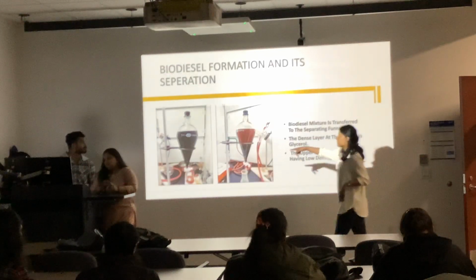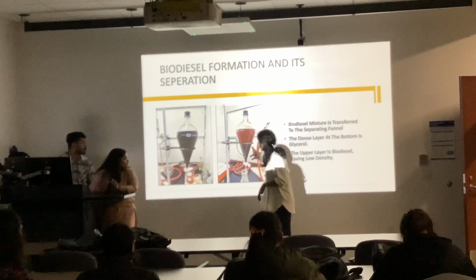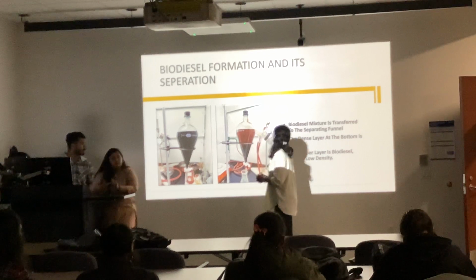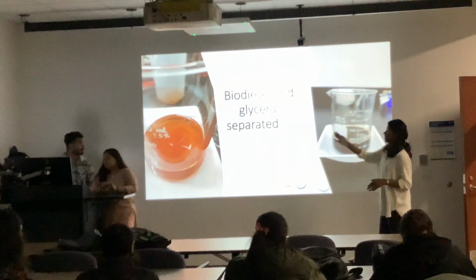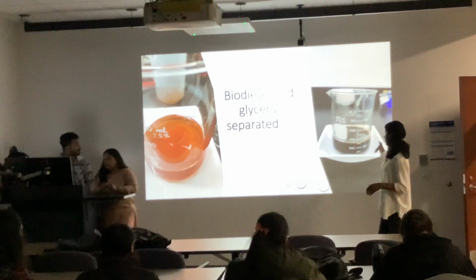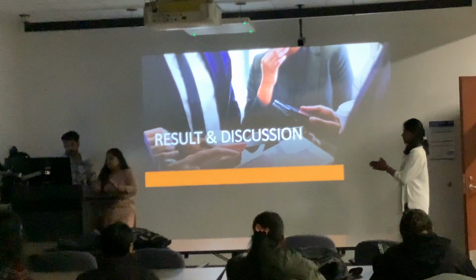As you can see, this is the biodiesel separated, and the top layer is biodiesel, and this is the glycerol that we got. This is actually after separation, biodiesel and the glycerol. Now, Janvi will discuss the results.